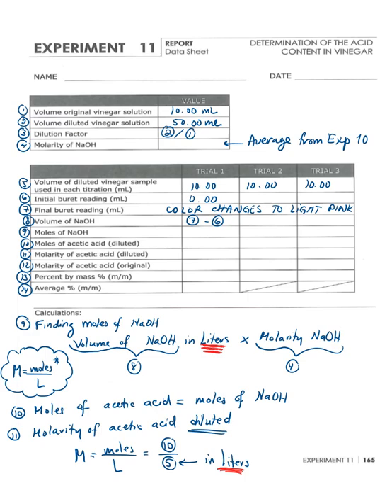Now for the volume of your vinegar sample, you're preparing your dilution, and from that solution you're preparing your samples. Your samples, you were taking 10 milliliters from your diluted solution and you were transferring those 10 milliliters into the Erlenmeyer flasks. So that's the volume that you need for your diluted samples.